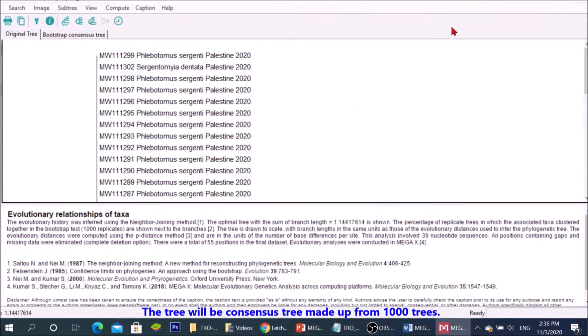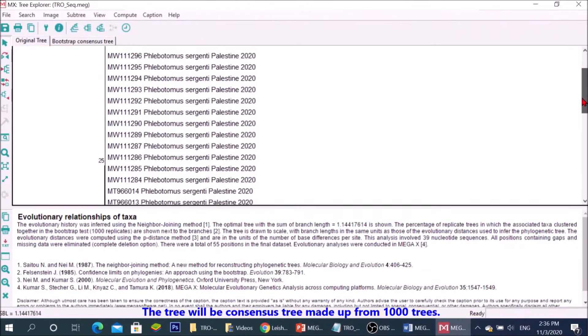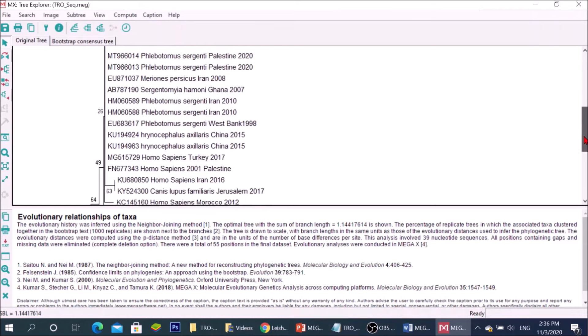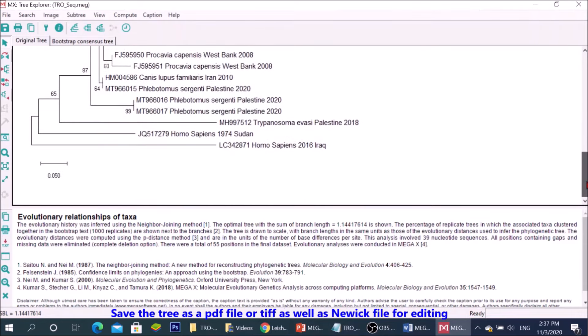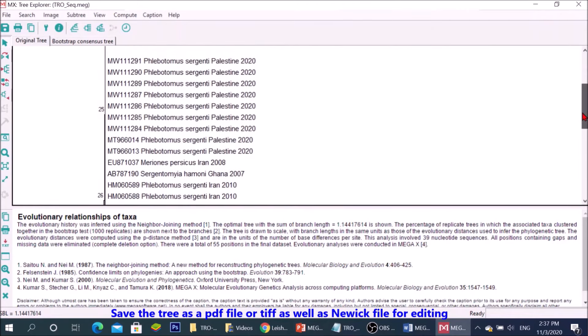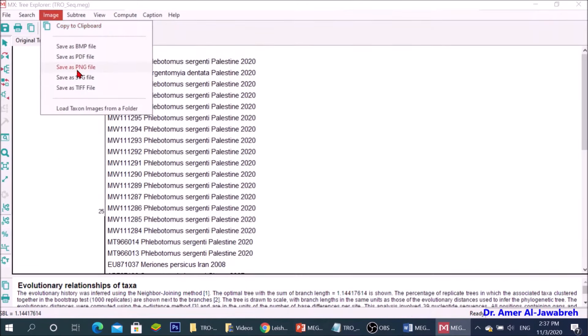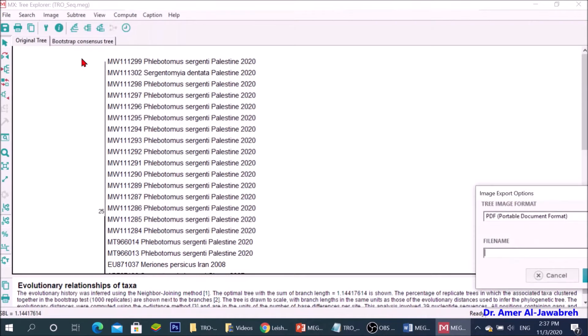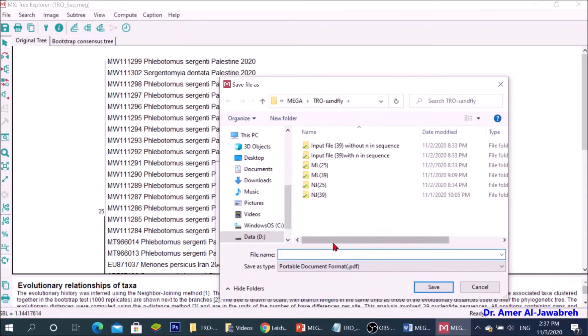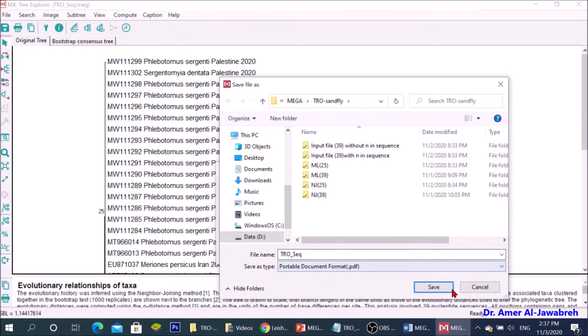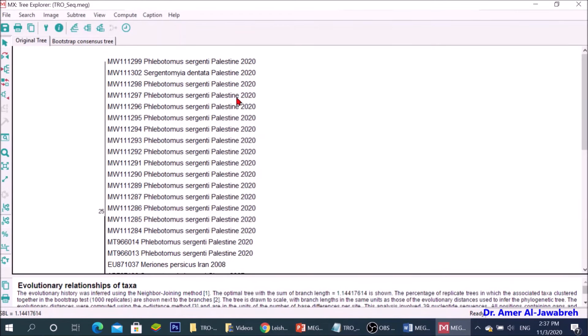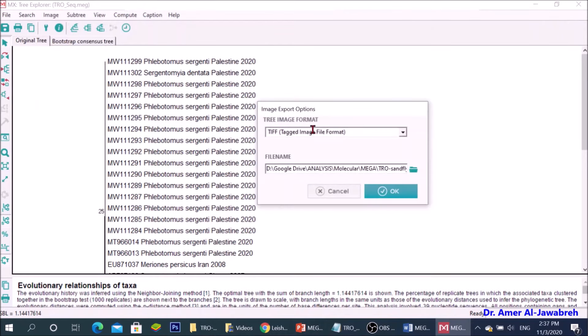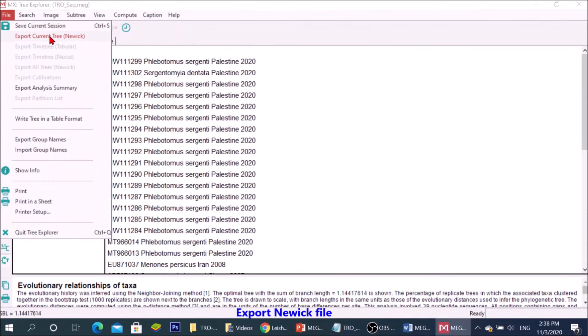The tree will be consensus tree made up of 1000 trees. Save the tree as a PDF file or TIFF as well as Newick file for editing.